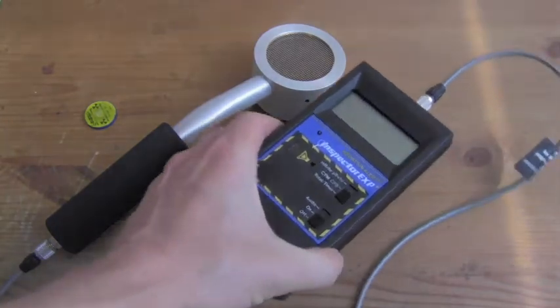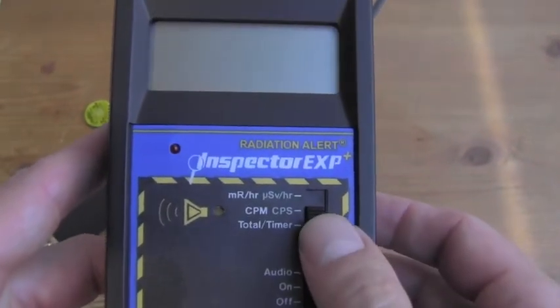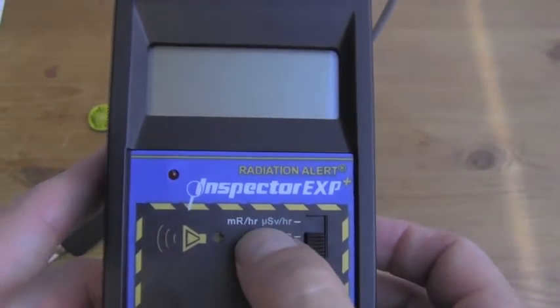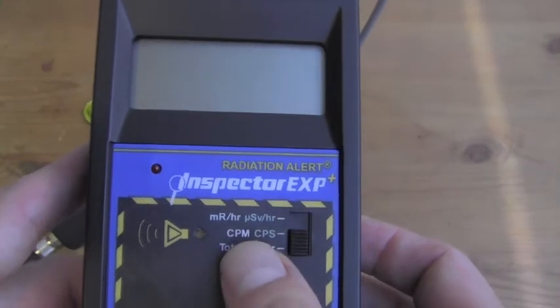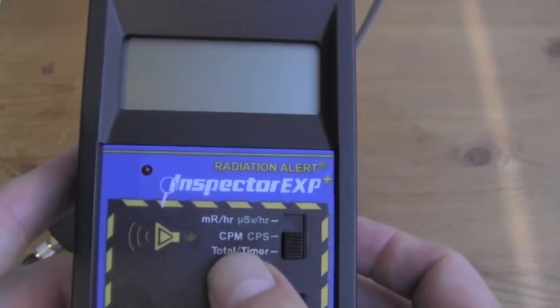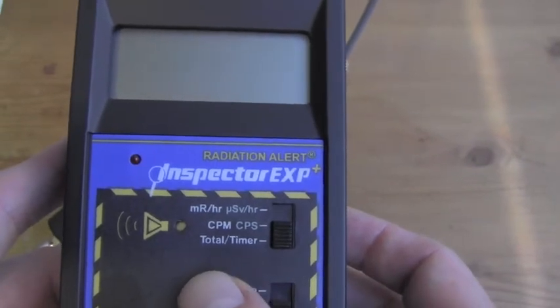First we'll take a look at the rate meter. We have our mode switch here, and it gives us a choice of dose, counts, and scalar function. We also have a choice of units: MR per hour, micro Sieverts per hour, CPM, CPS, and total count over a given period of time.